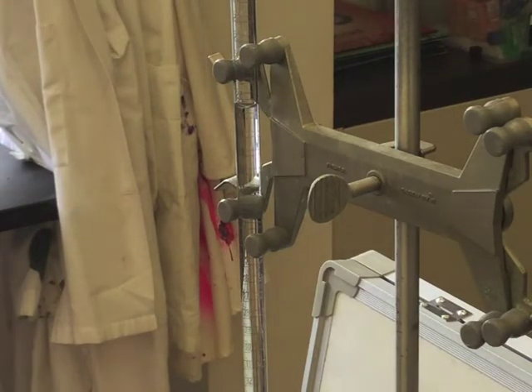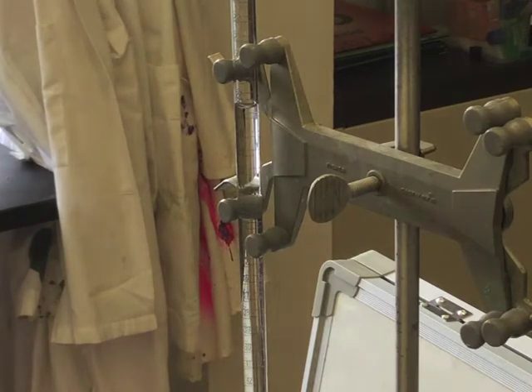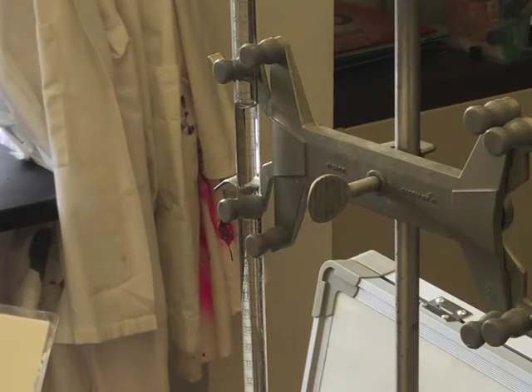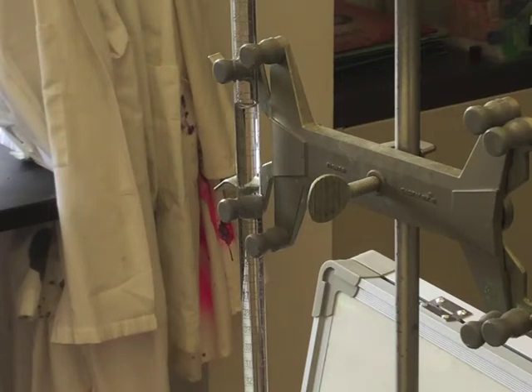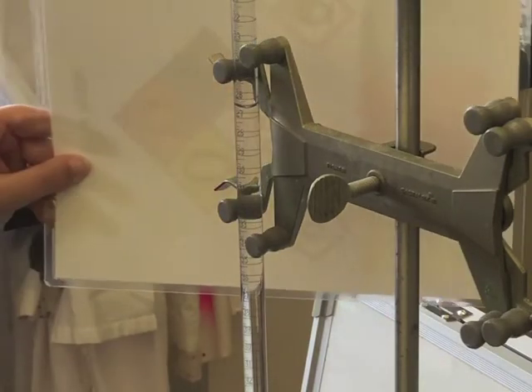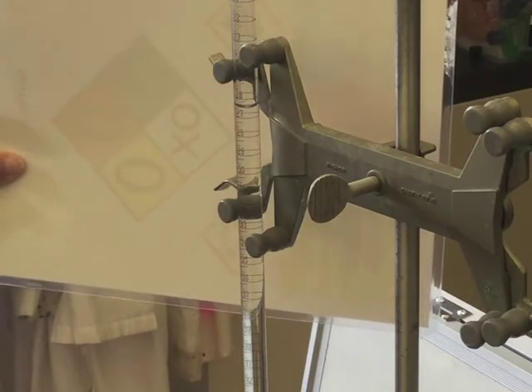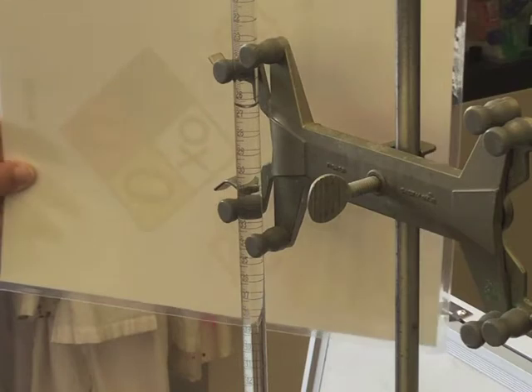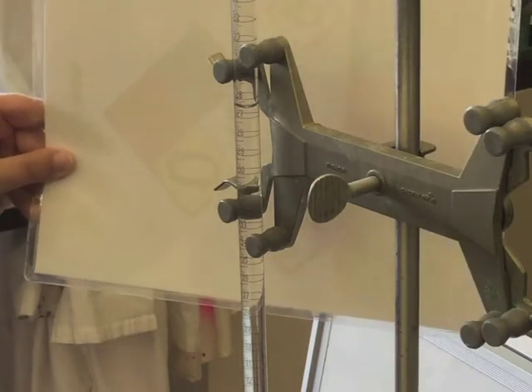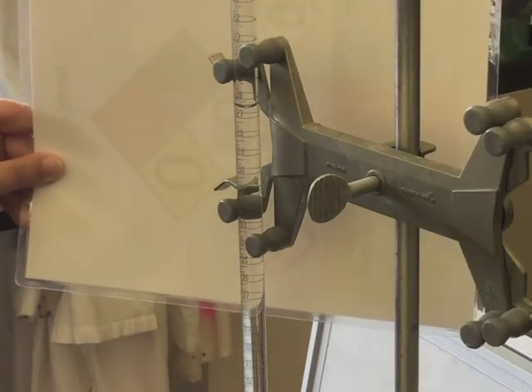The markings on a burette can be difficult to read if you can see the background behind the burette. Sometimes it can be helpful to hold up a piece of paper or a note card behind the burette. If the markings on the burette are in white, you may want to choose a dark paper.